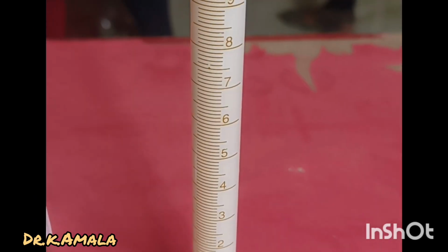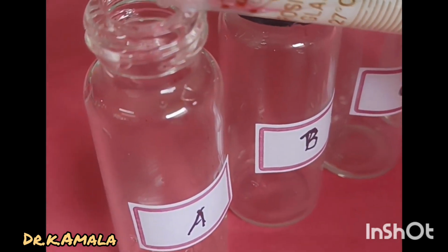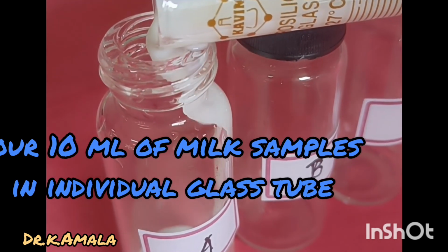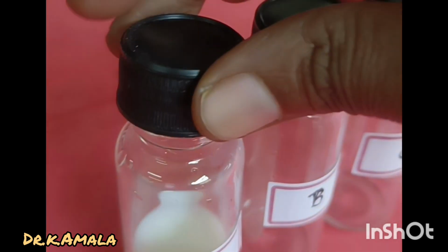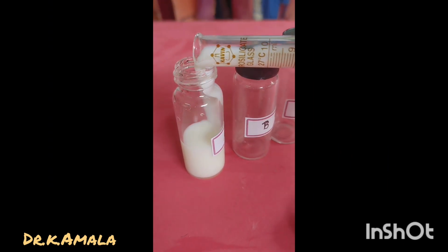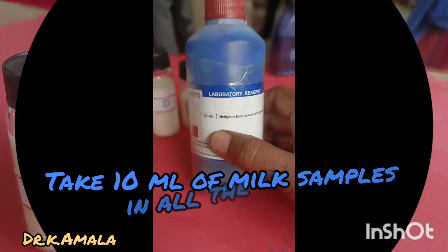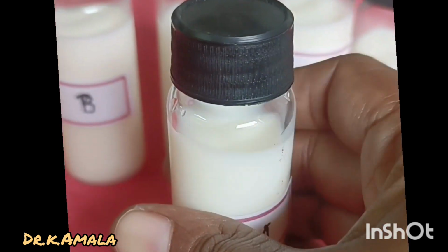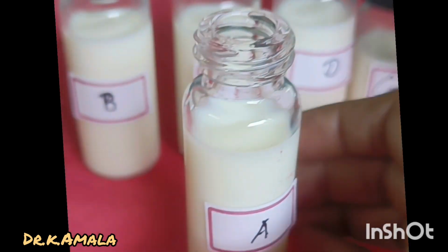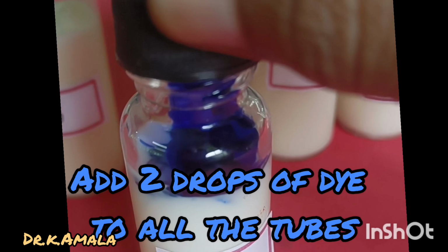Add 10 ml of each milk sample to the respective tubes and label them as A, B, C, D and control. One tube is maintained as control. Add 2 to 3 drops of methylene blue dye to all the test tubes and mix properly until you get a uniform color of methylene blue.